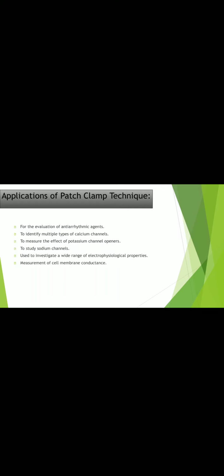Now we have limitations too. It is one of the very expensive techniques, so it's not available everywhere all the time. As we have seen while discussing this technique, it is time consuming, as we have to fix our pipette onto the membrane. There should be proper fixing of the membrane. If not, then we can't use this technique. There are chances of membrane distortion.